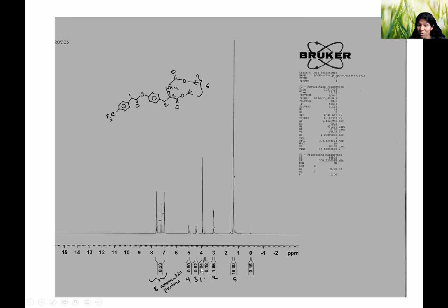So in the NMR software, you will have the option to integrate the peaks. These are the integration numbers, and generally we do not see them as a full number, like you will not see 1 or 2 exactly. So if it is 1.9, obviously this is 2.